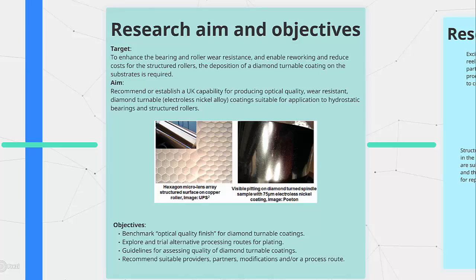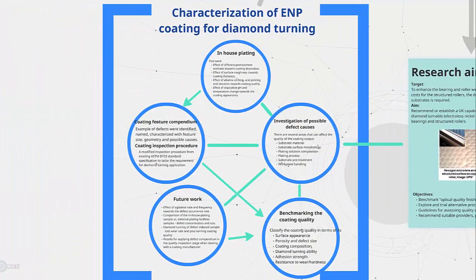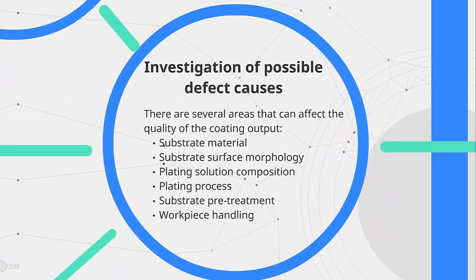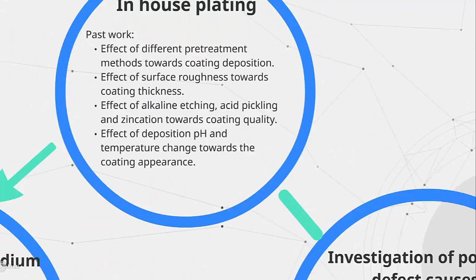In order to tackle this problem, first is to understand the cause of those defects. By varying pre-treatment methods and plating parameters, we were able to observe the development of these defects.